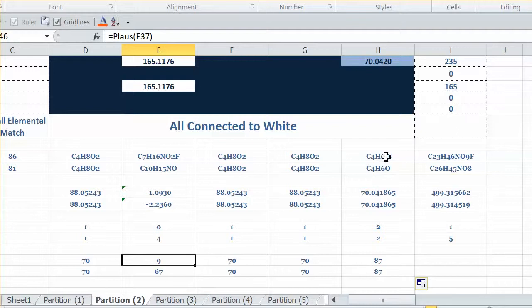The other formulas are very common. So, for example, C4O, there are a lot of compounds that can be divided into subgroups where some of them have C4O. A 9 is not that unusual, so we certainly wouldn't rule it out. If it was a 1 or a 2, we might say that it's not as likely as the other set of formulas.